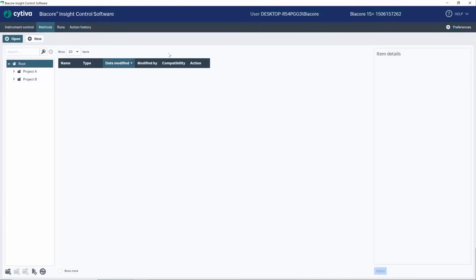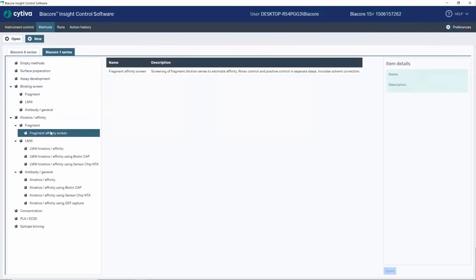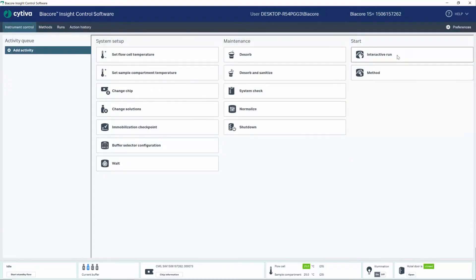The software is designed to help you set up your experiments. Either you can use our predefined method templates that are tailored for different applications, or you can try out our new feature called Interactive Run, where you take full control of the instrument and add commands in real time, one by one, and then take decisions on what to do next based on the results you get.